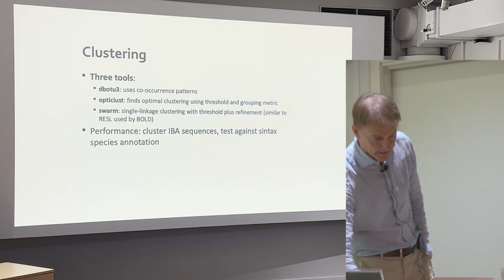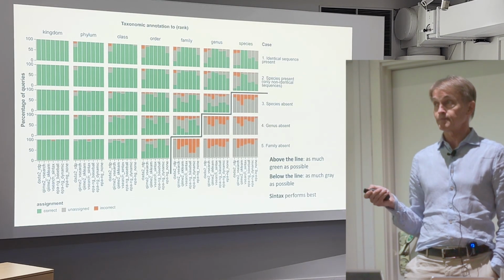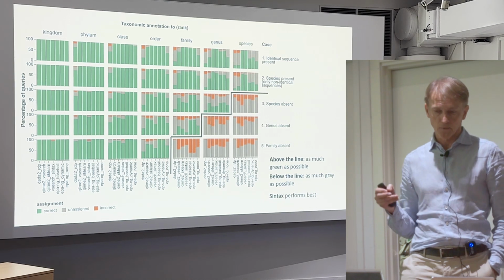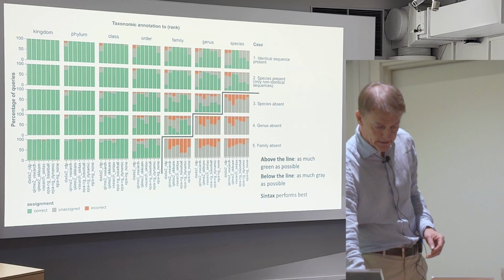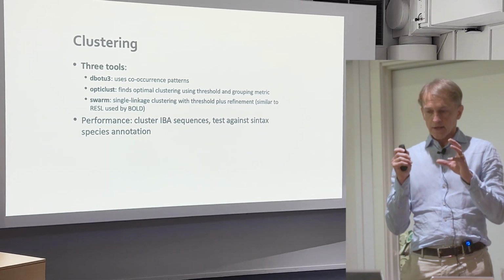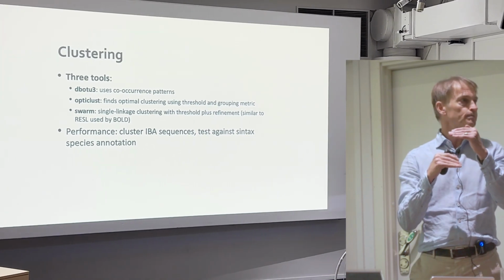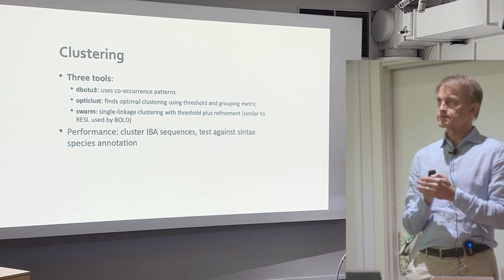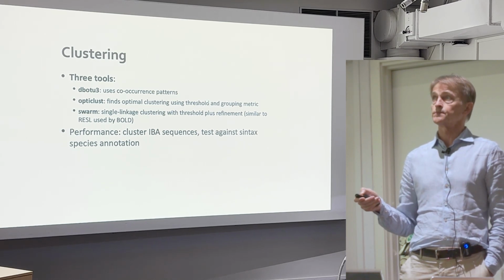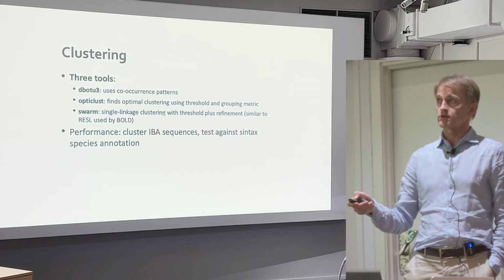So, and perhaps I should mention, we just got funding, another Wallenberg project grant was recently announced to try to work with building these large insect trees needed for phylogenetic placement. Okay. So now we have some name for each of the unique sequences, but then we're grouping them into species, so related or very similar sequences that might represent the same species. We group them together. For this, we tested 3 different types of tools.